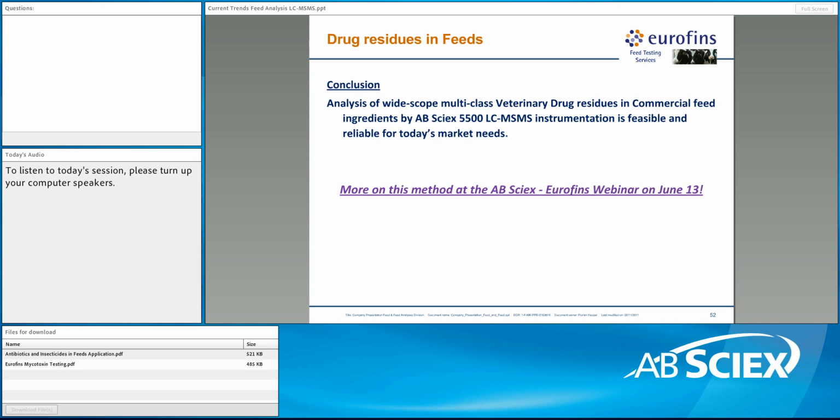We have not done any serious amount of work here on amino acids in feeds. We believe that the high level of amino acids in feeds would probably still be best served with the current methodology. Where we may see some applications is the presence of amino acids in fluids, maybe animal fluids, or in very, very low level matrices where amino acids are not encountered at high levels.